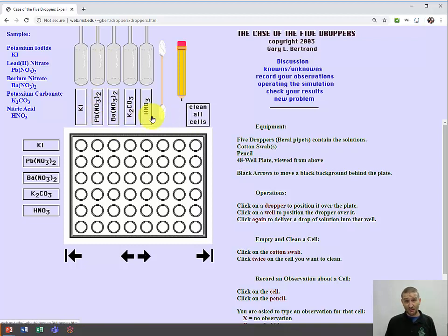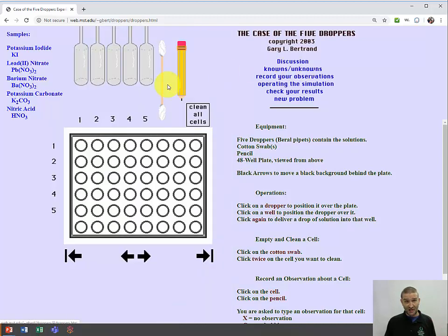But when you're set here and you don't refresh, you can go to unknowns. I'm just going to keep the same set of unknowns. It's just that now you only know that it's bottle 1, 2, 3, 4, and 5. So once again, we're just going to go ahead and put substance 1 in each of these columns. And then we rinse and repeat for all of those. Then we put 1 across for all of these. Then we come and we do the acrosses.